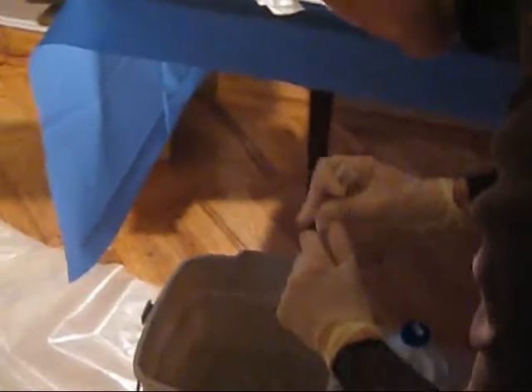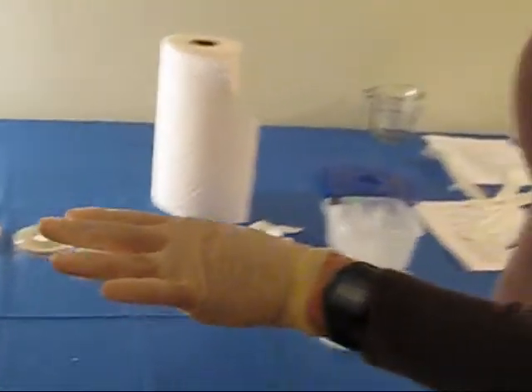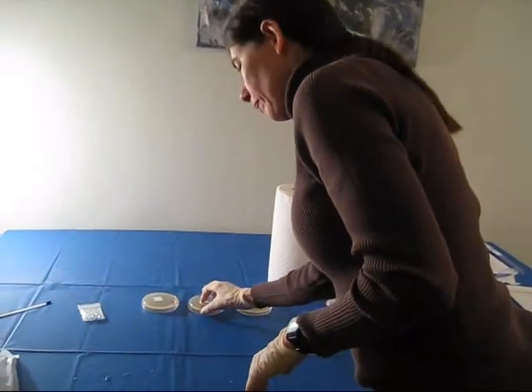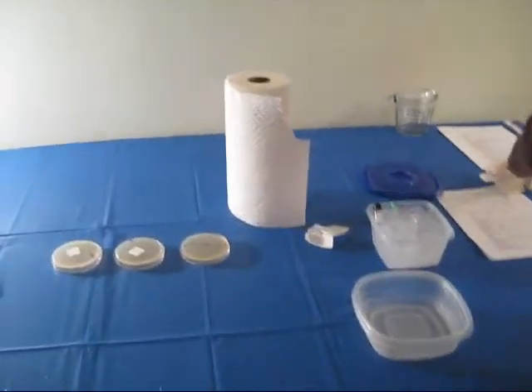Now we get rid of these. What are these? These are the bacterial stocks that we just used — get rid of them. So now we've cleared all of the bacteria off of this table, except for what's on these plates. None of these things are contaminated.